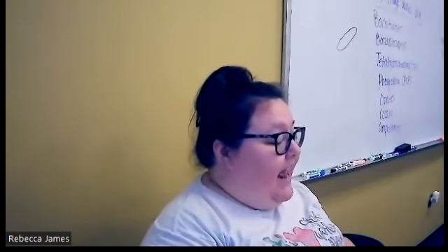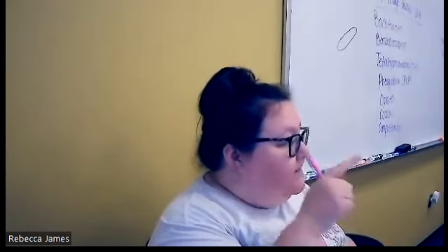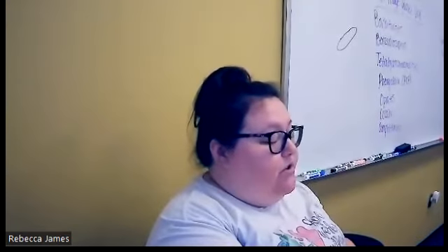Mansoni has a spine out to the side. Y'all see that spine, that like needle-like thorn out to the side.